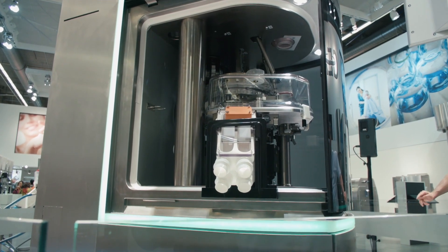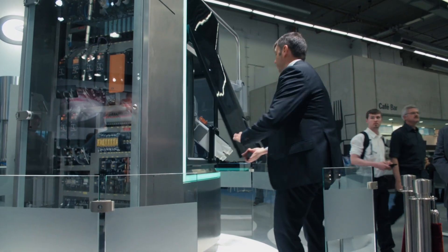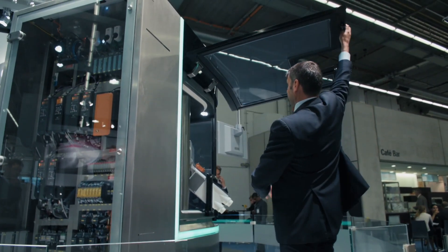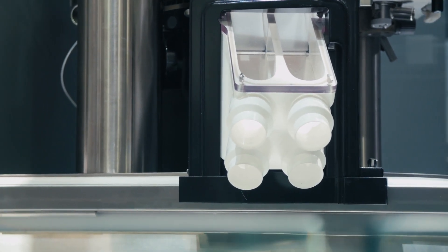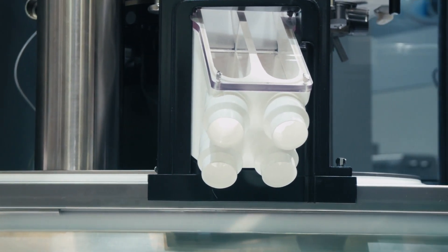This is the Module Q, the latest development within the module range. The module range of tablet presses distinguishes itself by the exchangeable compression module. With the Module Q, we've taken it one step further to put the innovation of that range of machines more to the front. Specifically with this machine, we have combined all our innovations from different machines into one — so you get all the good stuff of all our machines in one.